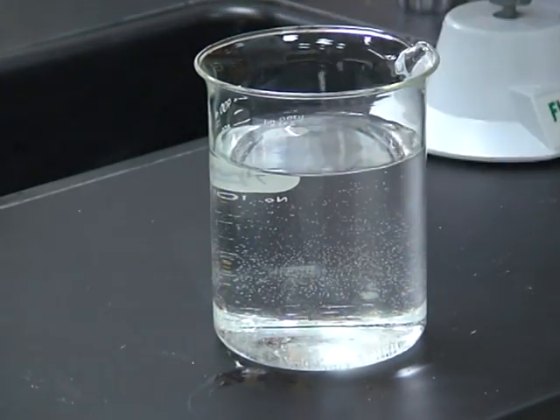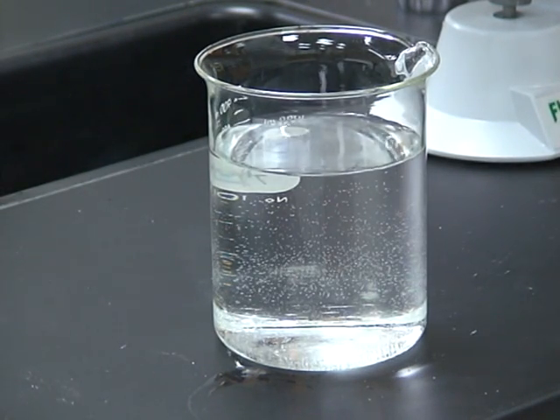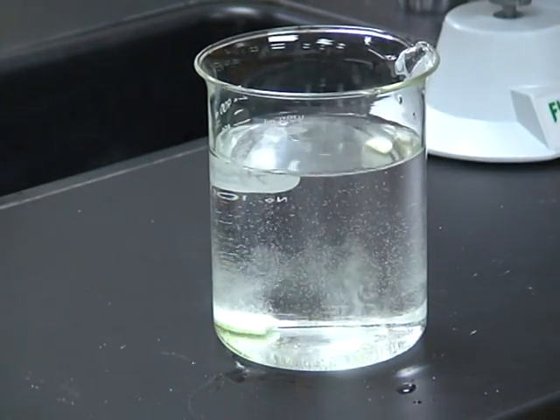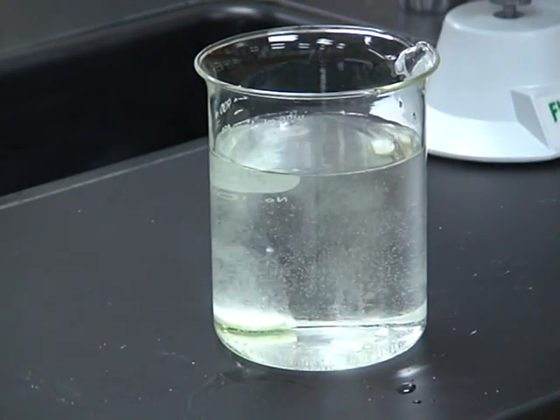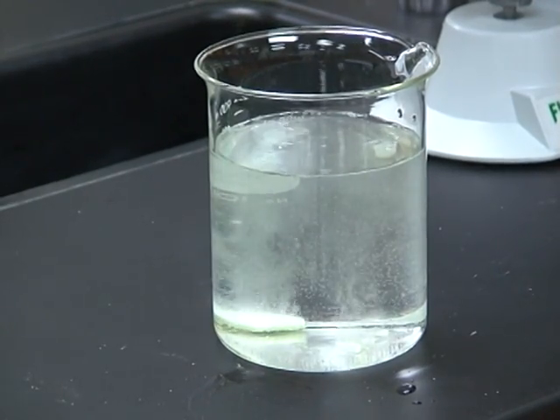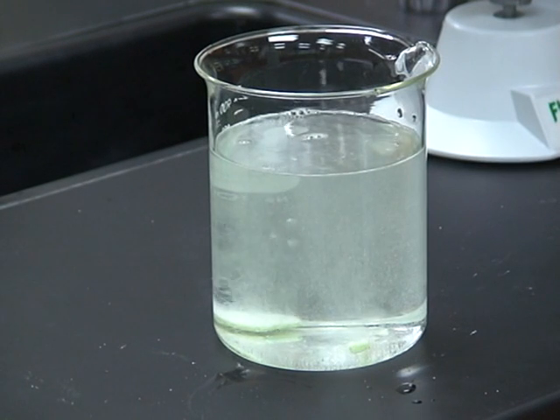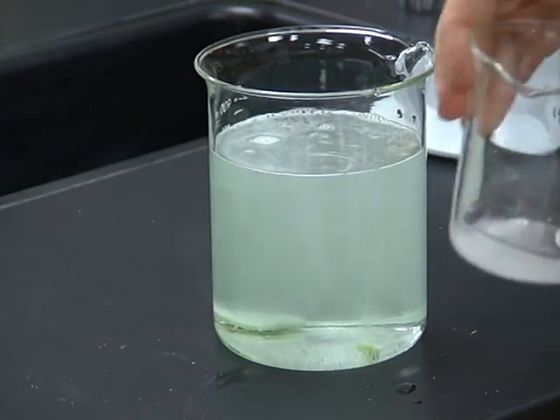Another example of a physical or chemical change would be water. Again, this time I have an Alka-Seltzer tablet. I'm going to put it in the water here. And you can see very clearly that there's gas bubbles produced, so that's an indicator of something. We'll let that go for a minute. And it's still bubbling. So while that's happening, let's do one more.